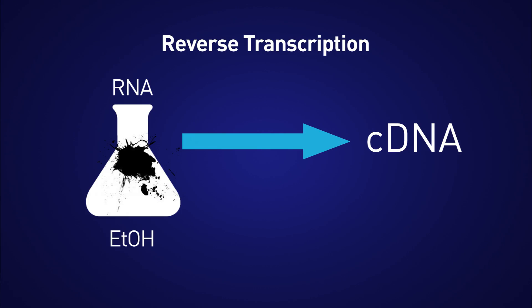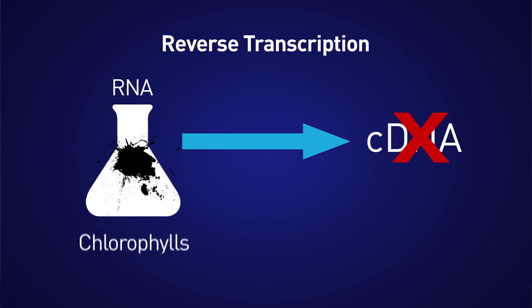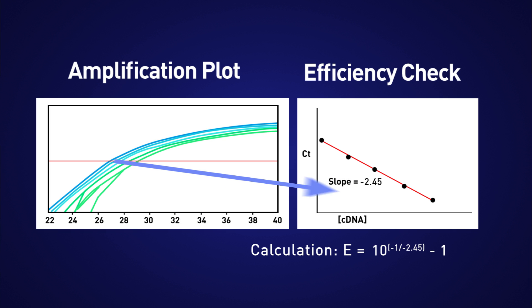Let's review some causes of high or low efficiency and how to fix them. The most common cause of efficiencies greater than 100% are inhibitors. This can be carryover from the sample itself, such as heparin or humic acids, or contaminants from the RNA or DNA isolation, such as SDS or phenol. Inhibition means that even as you add more template, the CT value does not shift to earlier cycles as you would expect. This flattens out the efficiency plot, resulting in a lower slope and thus efficiency over 100%.